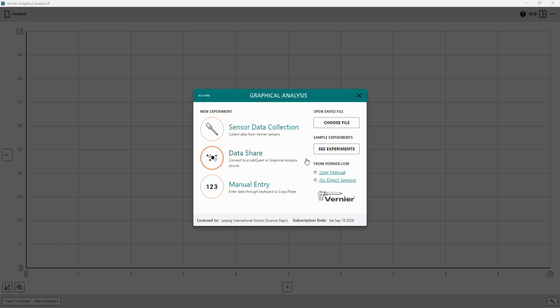If you have, and you should have, saved the file of your experiment, you should always be able to upload it by choosing file here and uploading this GMBL type of file, and it will load all your data sets. This will allow you to do all the post-processing at home. You don't have to do that during the experiment. In the experiment, you focus on the data collection, proper runs, proper trials, running your equipment, and then collecting everything and packing up. You don't have to worry about any processing. That happens in the next steps.